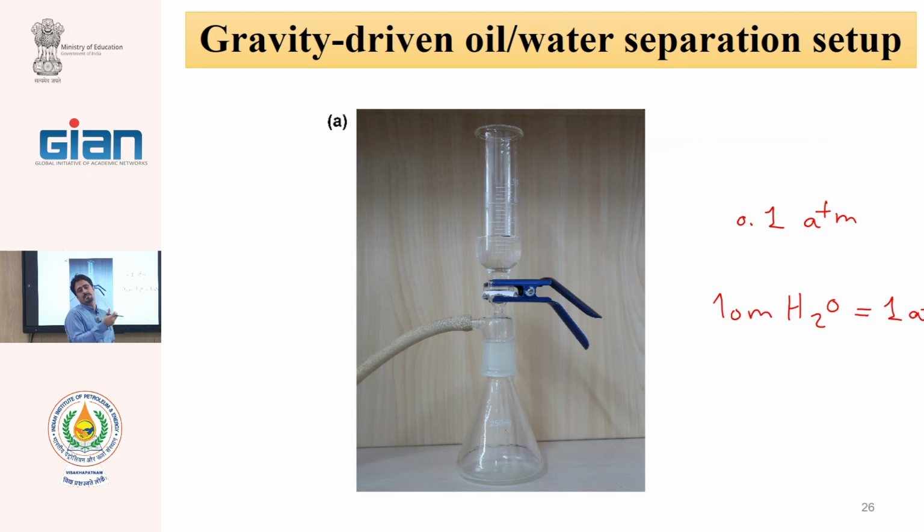If the membrane is hydrophilic, water passes and oil not. On YouTube or in the supplementary information of the oil-water separation membranes, you can see many videos that pour the water here and rapidly oil separates from the water.